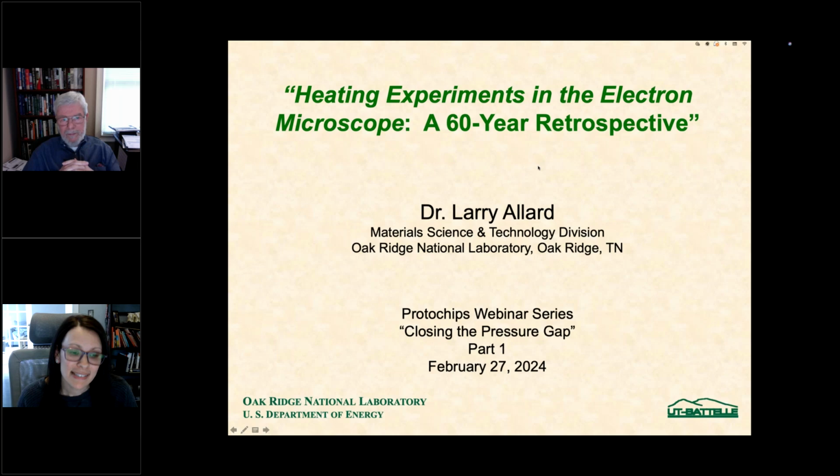Because catalyst materials are typically in nanoparticle form, the TEM is really an ideal characterization tool with its powerful resolving capabilities. But the characterization of static materials before and after a reaction doesn't necessarily lend insight into the mechanisms that lead to operational changes in the catalyst over time. Over the years, technology evolved in an attempt to introduce gases safely into the vacuum chamber of the TEM in order to watch these materials undergo these mechanisms under a more realistic environment, with hopes of really getting some direct insight into how their structure really affects their function.